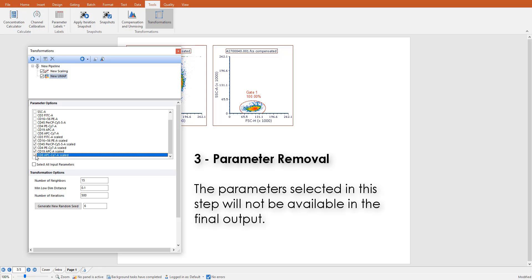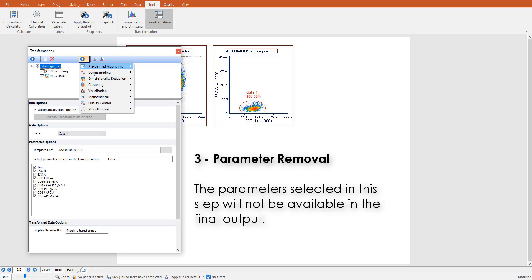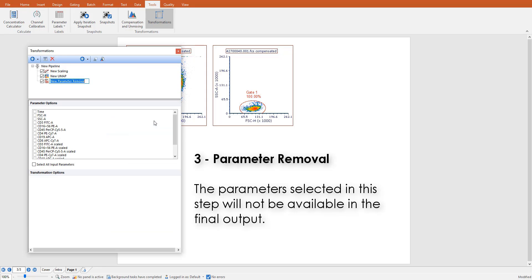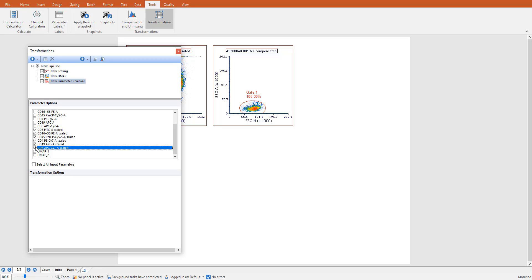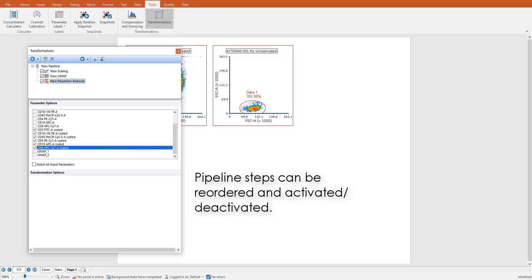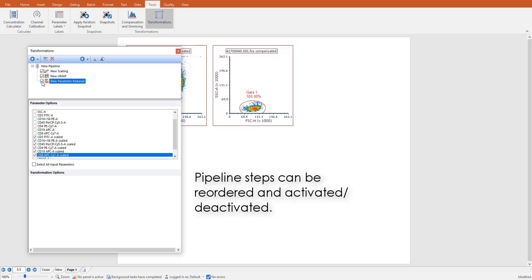Finally, we will remove some unwanted parameters to make the final output easier to handle. Steps can be reordered by drag-and-drop and can also be deactivated or activated on purpose.